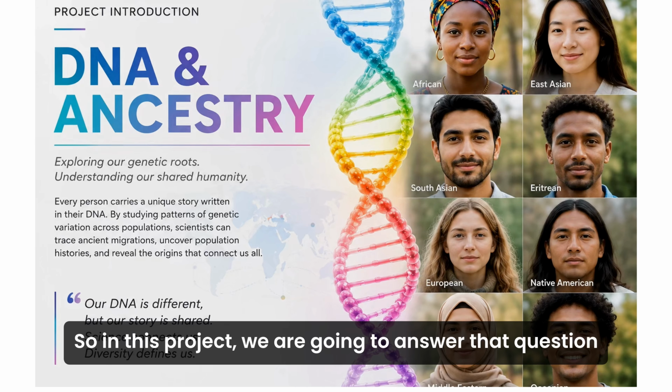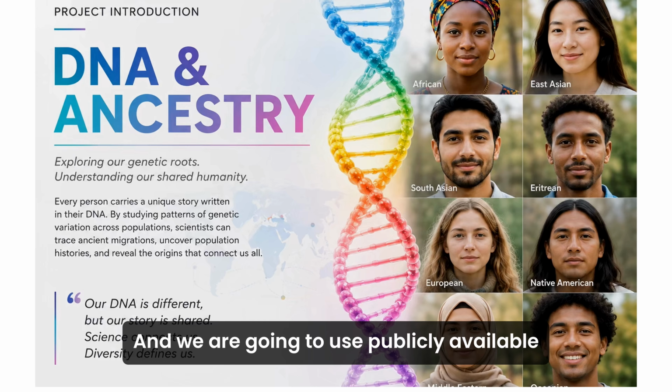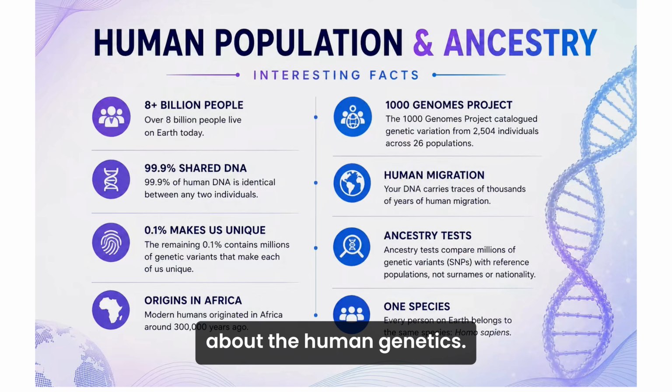So in this project, we are going to answer that question through a reproducible bioinformatics workflow, and we are going to use publicly available genomic data from the 1000 Genomes Project. Before we begin, I might share a few fascinating facts about human genetics.